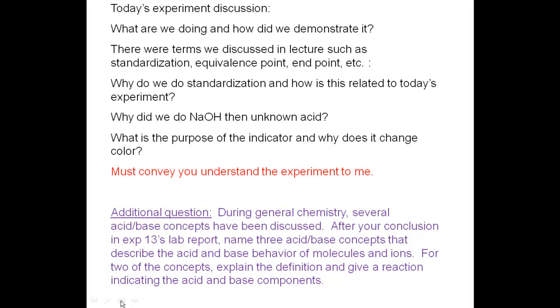During general chemistry, several acid-base concepts have been discussed. After your conclusion in Experiment 13's lab report, name 3 acid-base concepts that describe the acid and base behavior of molecules and ions. In your textbook, back in Gen Chem 1, you learned about acid-base theory. I want you to name them. Name the 3 acid-base concepts.